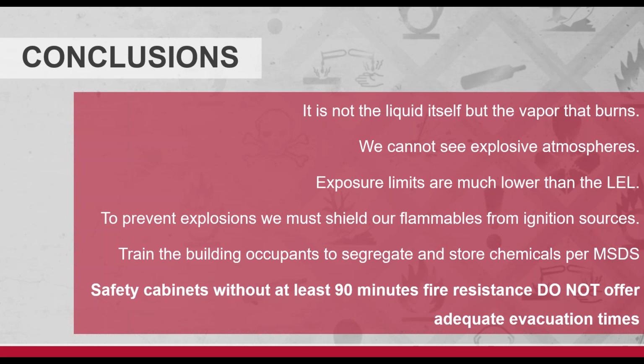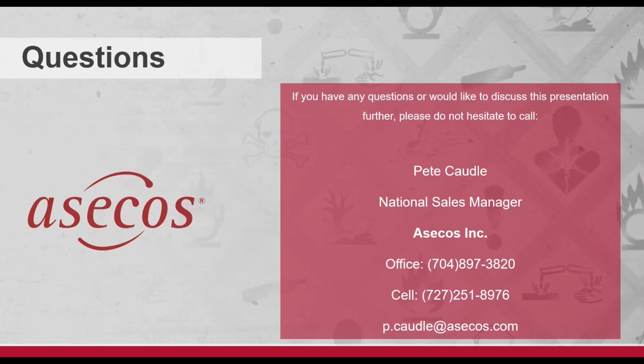How we train people, let them understand your technologies, the way you created the space. Have whoever wins the tender, the casework guys, whoever's supplying this cabinet, the fume hoods, all of that stuff, get people up to speed on your life safety devices. And honestly, to me, 90 minutes is the only solution that's out there. Technology's tried, it's proven. A lot of companies out there provide it, and truly it does segregate and help people store safely.